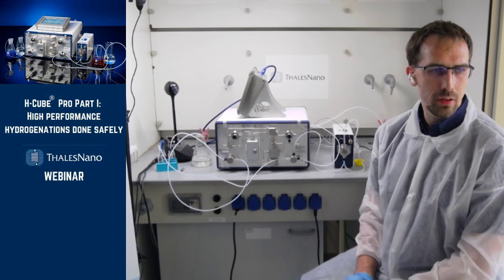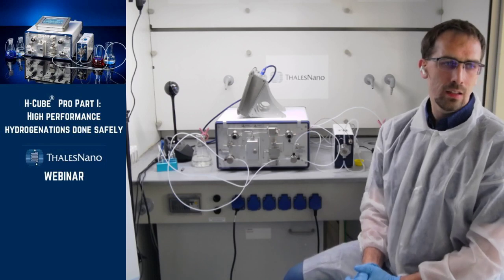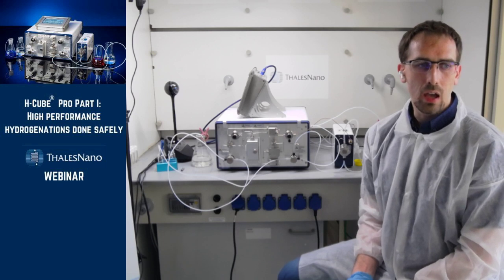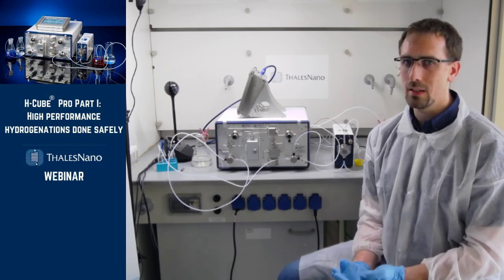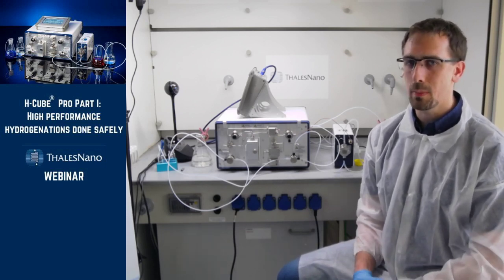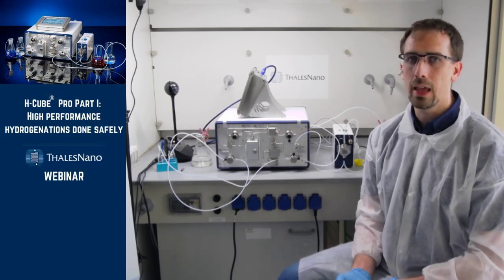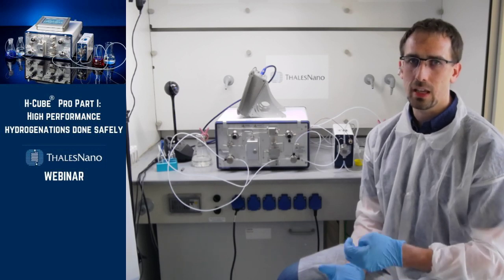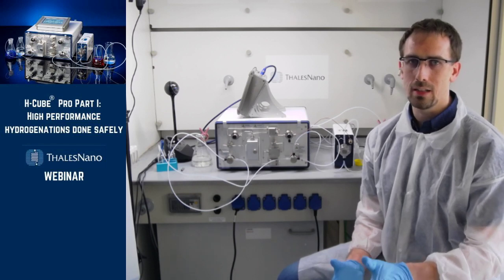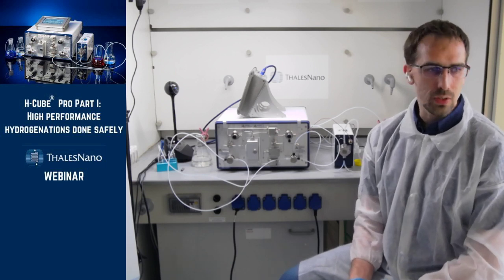Can I reactivate or repack cartridge by myself? Yes, you can do that if you have a method for reactivating the catalyst. To repack, you need a special tool to seal the cartridges. This is called the CatCart Packer. So we offer our customers the opportunity to buy empty cartridges, which they can fill and seal. You would be able to also use your own catalyst, which you have developed and prepared, and fill that into our cartridges.